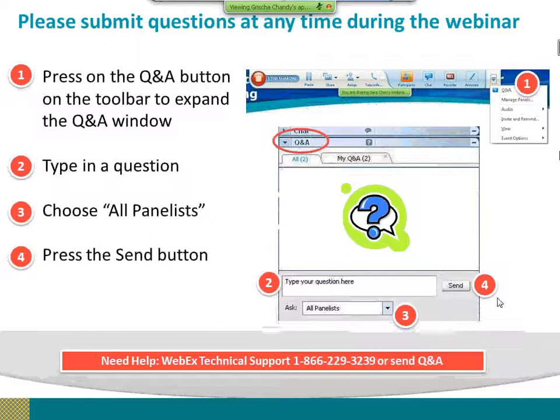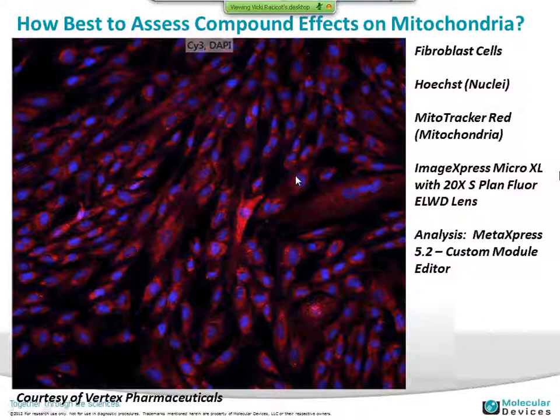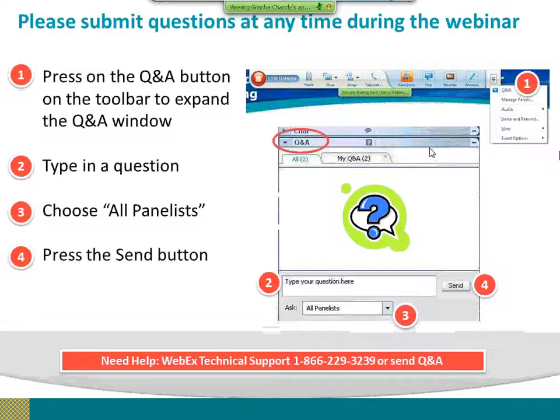So there's a couple of questions. So Vicky, the example analysis you did with the Transfluor module, just looking for puncta in different compartments, what other applications or biological assays could that be used with?